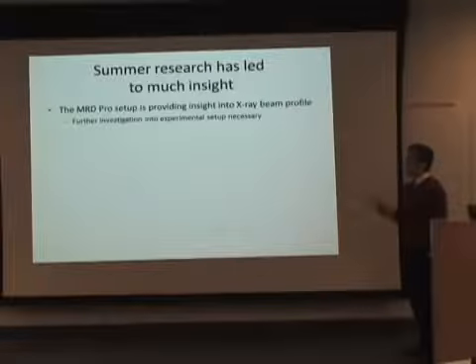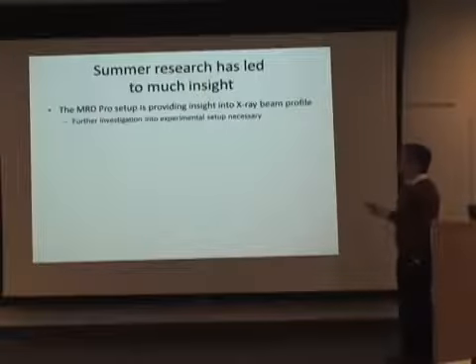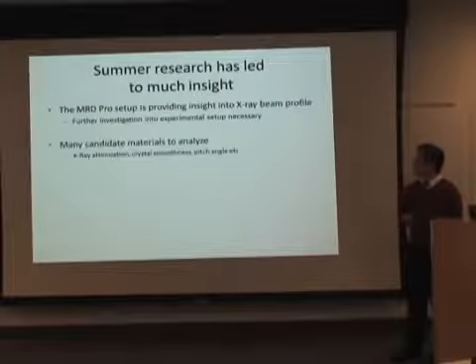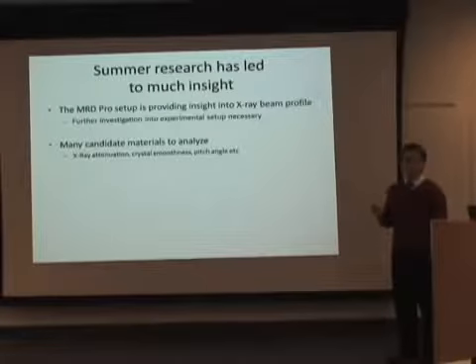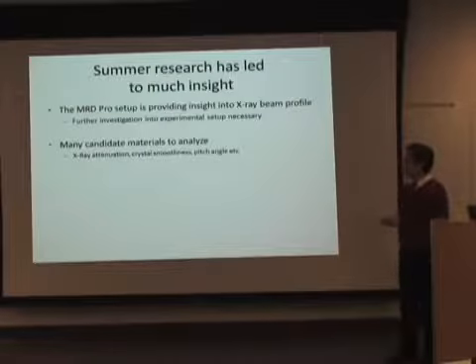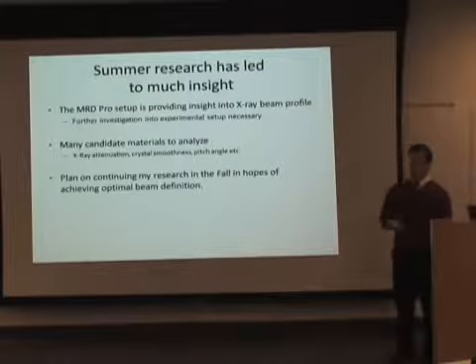My summer research has brought much insight into these X-ray diffraction techniques. The MRD Pro provided some good information, and the setup needs further investigation. Many candidate materials still need to be analyzed so that we can understand which is the best material for our purposes, or any other purpose there might be for X-ray diffraction. And I plan on continuing my research in the fall and hopefully progressing to optimize its performance.